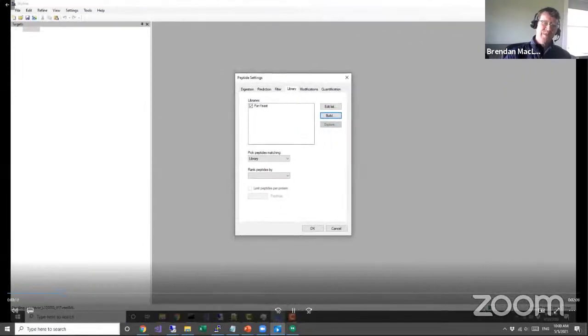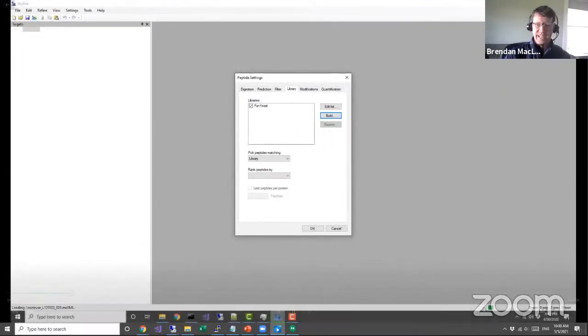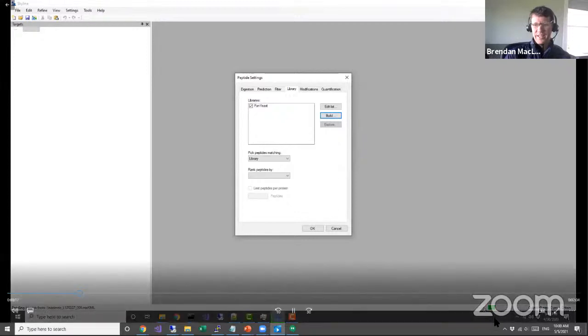So now we've gone into fast mode where every second is a minute. So this is going to do 27 minutes, and you can see this progress. It's kind of getting grayed out, but this is the progress of building the library, and you can see it's going through a number of mzXML files.